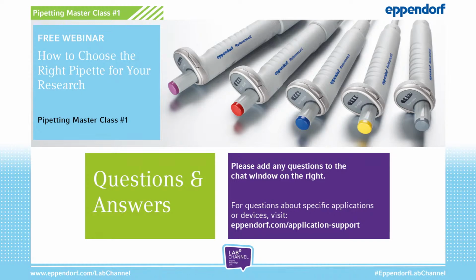In general, air cushion pipettes tend to drip when you are pipetting volatile liquids. This is due to the air cushion, which exists between the liquid sample and the piston inside the pipette. Air is flexible. It adapts to external influences such as temperature and air pressure, and thus it expands or compresses.